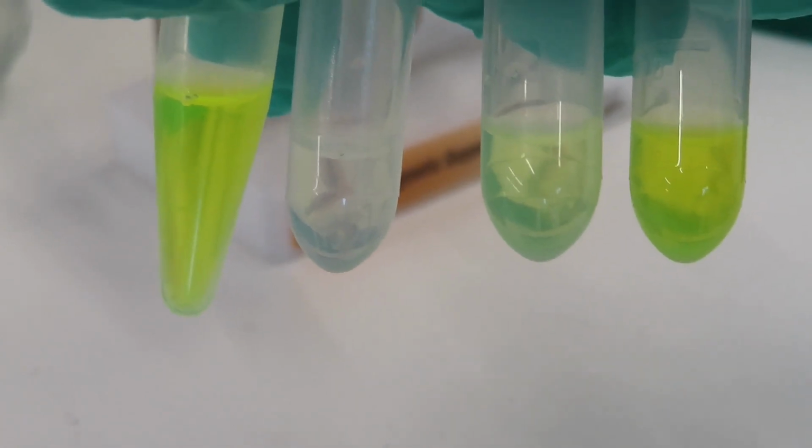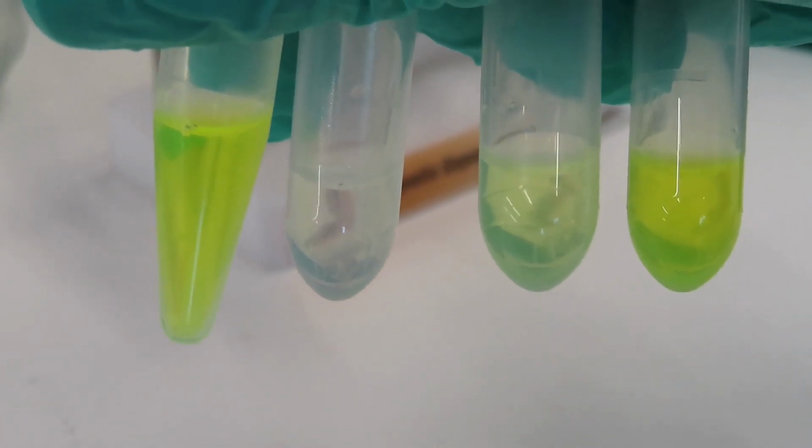With this last example of a protein purification method, we move to the last section, protein characterization.